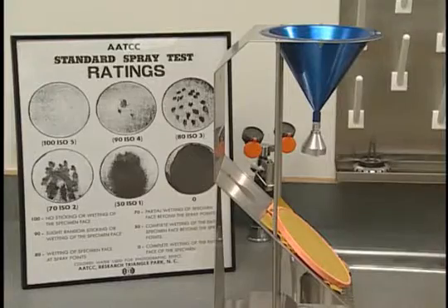A laboratory ring stand with a support for a 150 millimeter funnel is attached to it. A spray nozzle with 19 holes in an arrangement of one center hole surrounded by concentric rings of holes is secured to the bottom of the funnel by a rubber sleeve.